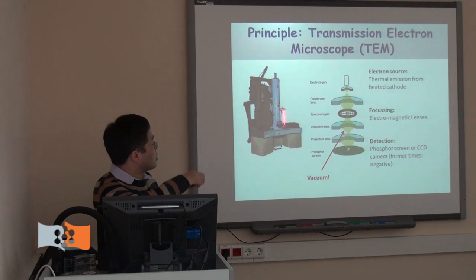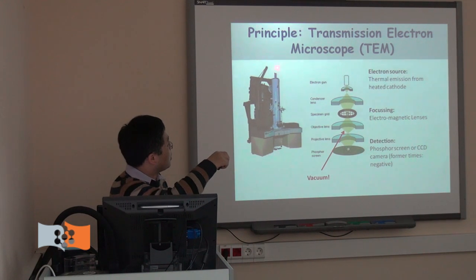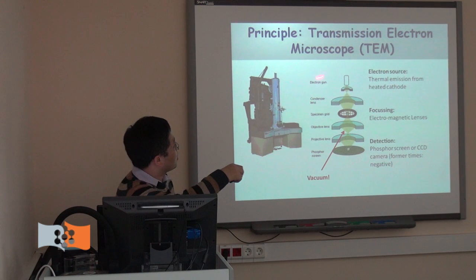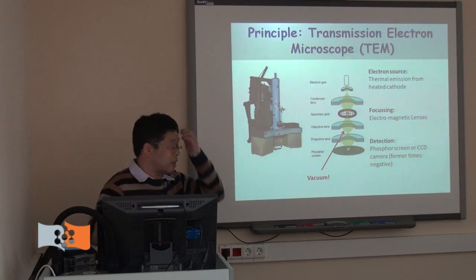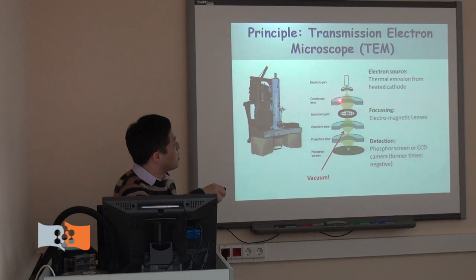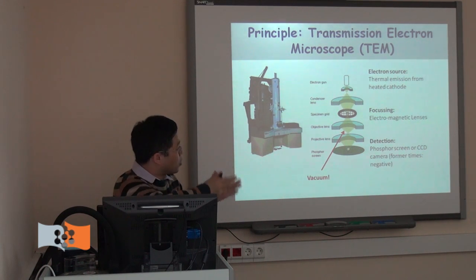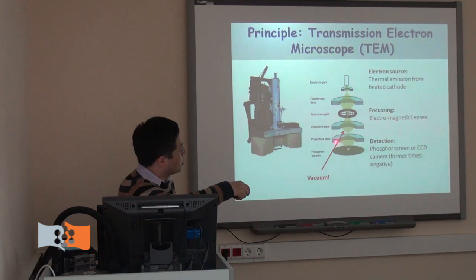So basically, this is an older electron microscope. The electrons come out from here. This is a transmission electron microscope. How do we use it? Like light microscopy, we have lenses, but here the lens is made with electromagnets, which focus the electron beam, spread it, and magnify it. So this is where we get a projection.